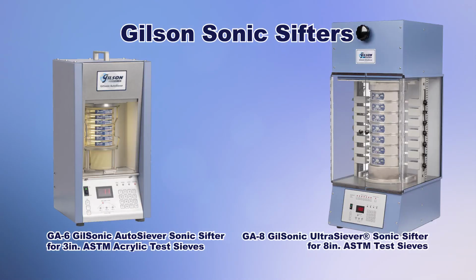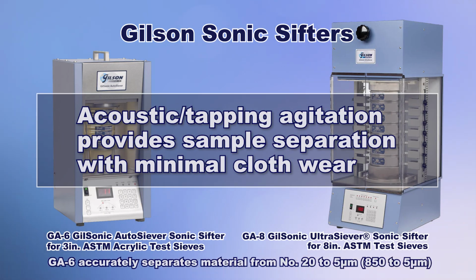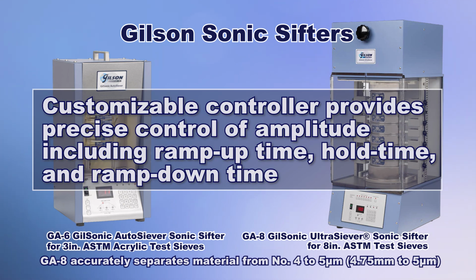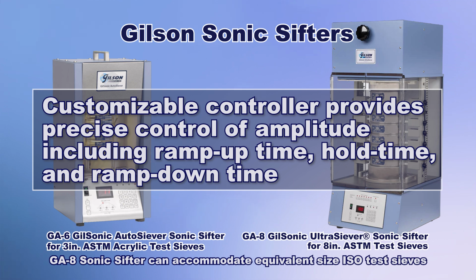For example, the Gilson GA6 Auto Siever Sonic Sifter and the GA8 Ultra Siever Sonic Sifter use continual agitation of 3600 sonic pulses per minute with a vertical oscillating air column and with mechanical tapping that lifts and reorients particles.